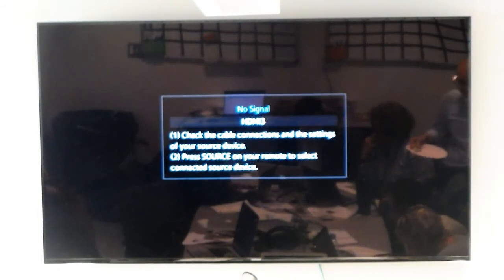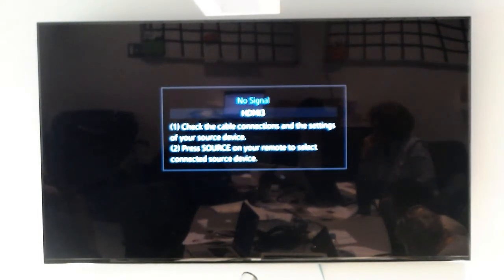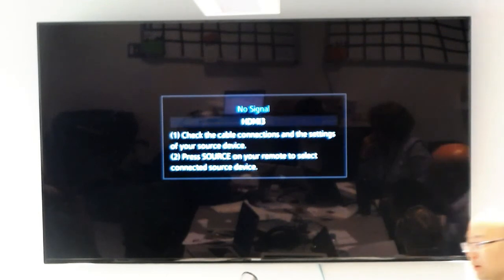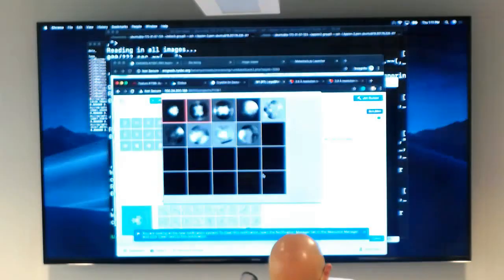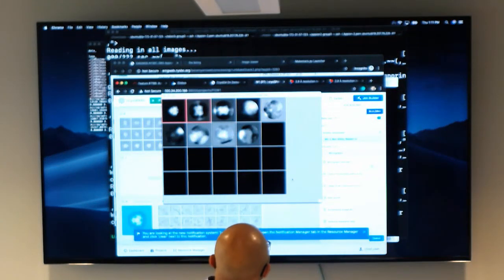Don't forget to select the right processing lane. That's just a peculiarity of how we're running the instance. Processing lane. So the tool is only for GPUs. That's going to be fun.